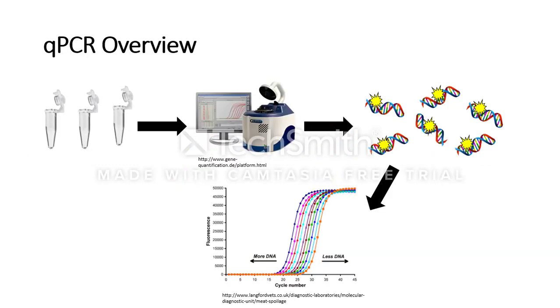Now, let's put everything together. First, when conducting qPCR, a qPCR reaction is prepared with the addition of fluorescent dyes or fluorescently labeled primers. Then, the reaction is placed in the qPCR machine. Fluorescence will then be produced during the reaction and measured by the machine in real time.